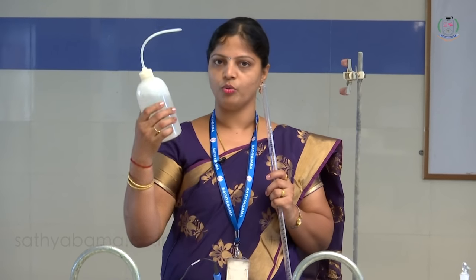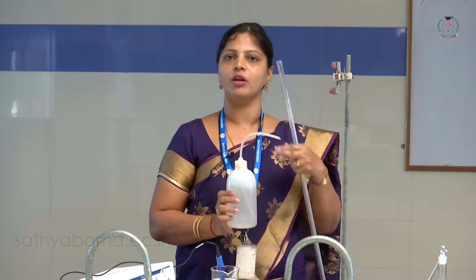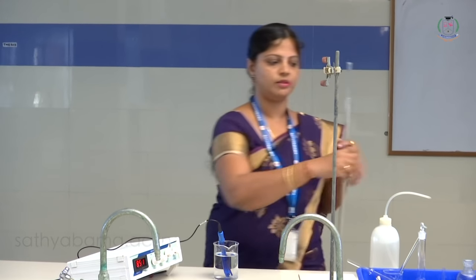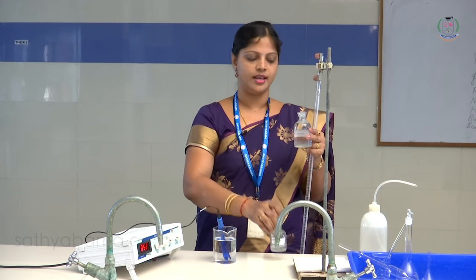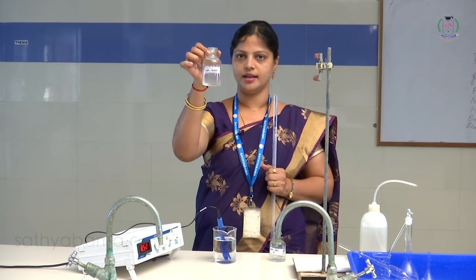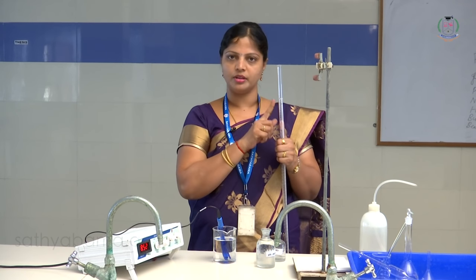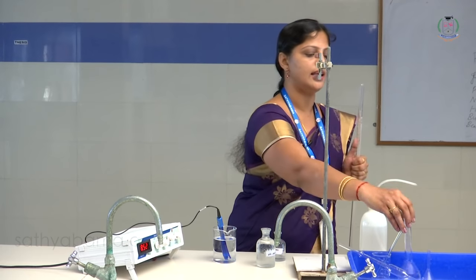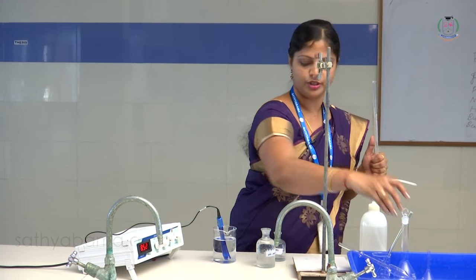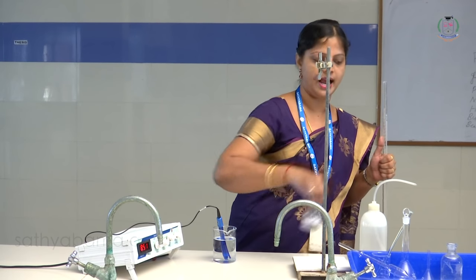Before you start any experiment in the chemistry laboratory, first wash all equipment with tap water and rinse with distilled water. Collect distilled water only in the wash bottle. Now I am going to take sodium hydroxide. For this titration you require only two solutions: pH HCl, marked in the laboratory, and pH sodium hydroxide. I will take sodium hydroxide in this burette after washing, and make up the HCl solution in a 100 ml standard flask. First, wash all the apparatus you are going to use.